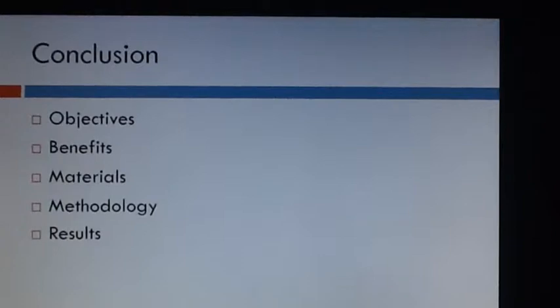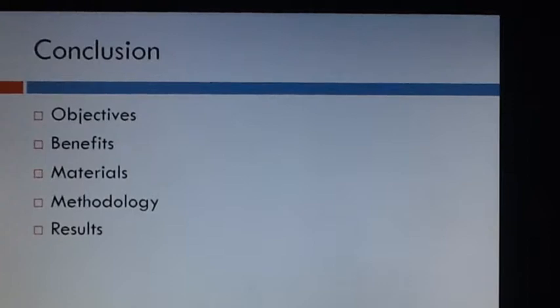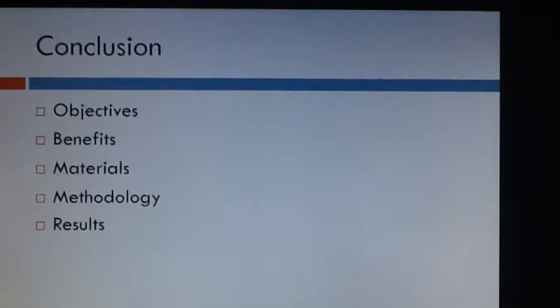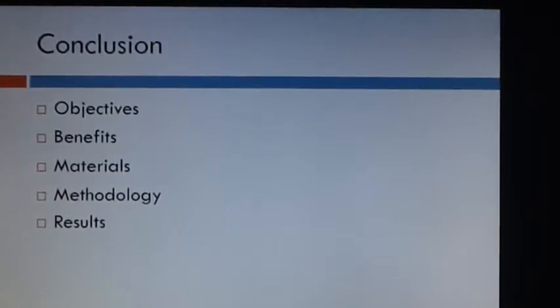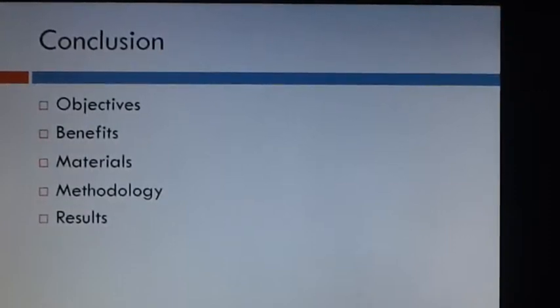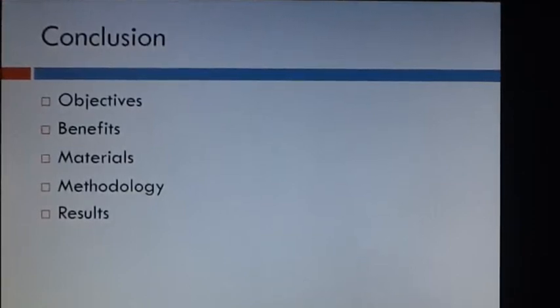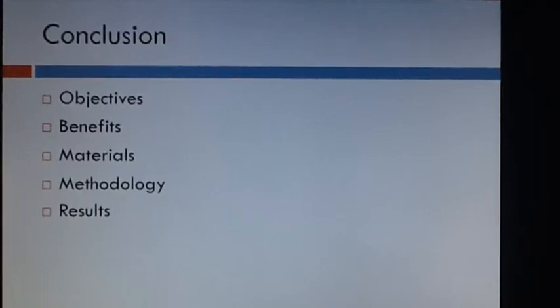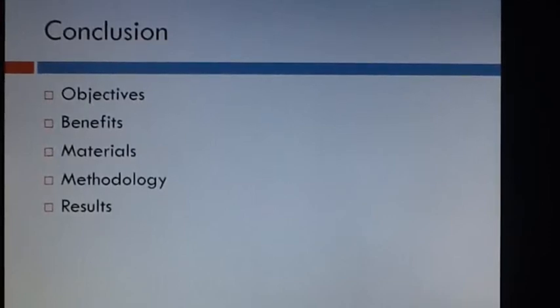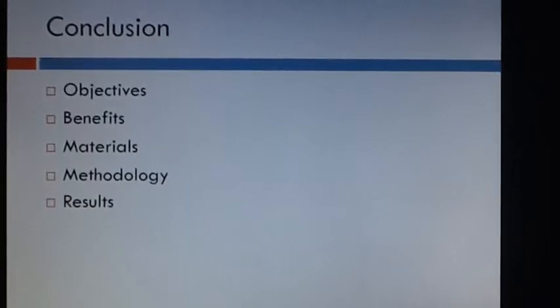In conclusion, I've told you about the objectives, benefits, materials, the methodology, which is steam distillation, and the results. Now you know the amount of essential oil from the 3 types of plants I've extracted and the percentage. You also know that it takes a lot of biomass to fill up just 1 bottle of essential oil. And lastly, if you want to use your essential oil, you would have to dilute it with carrier oil. Carrier oil is real oil, or any oil you can find in your kitchen. Coconut oil, olive oil, or just anything.